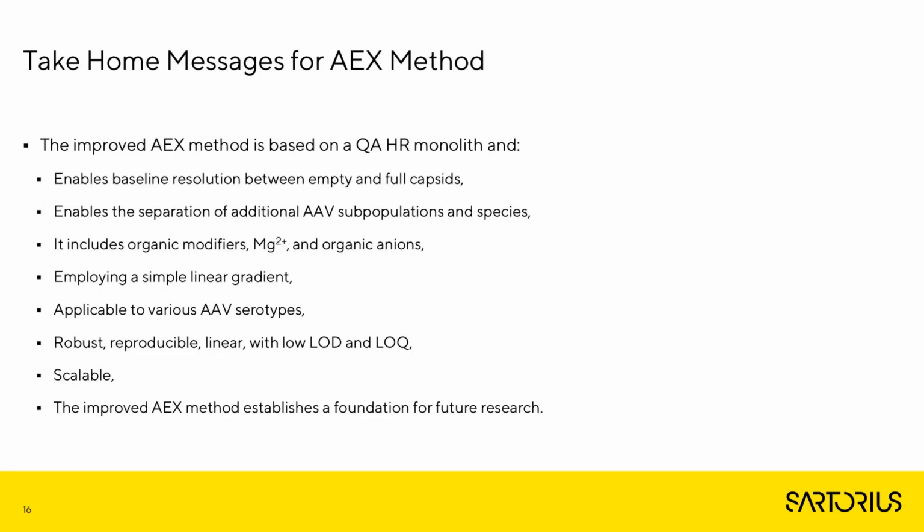If I want to conclude at least the first part of my talk, the improved ion exchange method, which was developed on the quaternary amine high reproducibility monolith, really enables baseline resolution between empty and full capsids. But not only that, we started to observe additional AAV subpopulations and species.